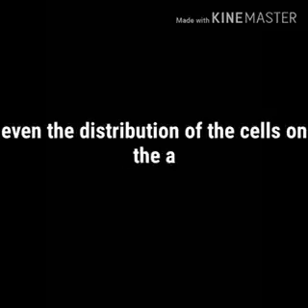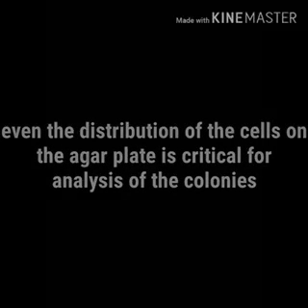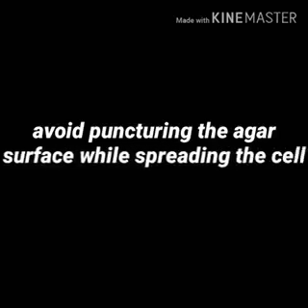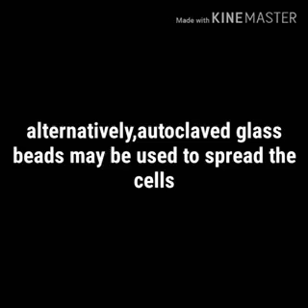Even distribution of the cells on the agar plate is critical for analysis of the colonies. A sterile hockey stick or L-shaped cell spreader is commonly used to spread the cell suspension while gently rotating the plate. Avoid puncturing the agar surface while spreading the cells. Alternatively, autoclaved glass beads may be used to spread the cells.